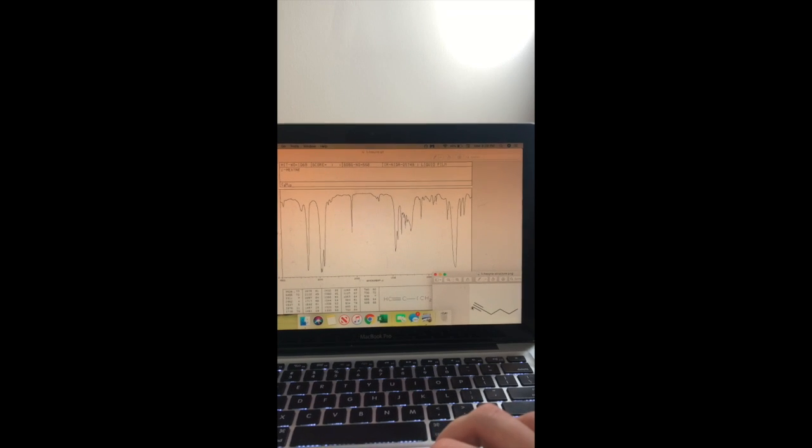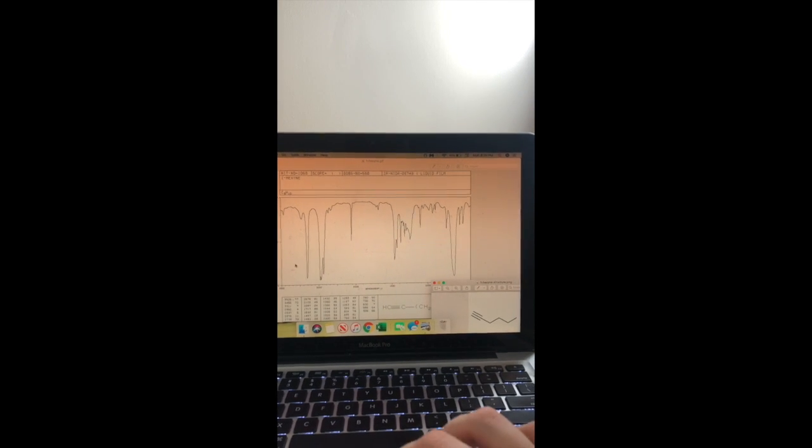Next we have 1-hexyne with two pi bonds between carbons 1 and 2. Because of the higher percent S character, alkynes, or triple bonds in general, require greater energy in order to cause a detectable vibrational stretch. Therefore, an sp hybridized carbon of an alkyne will appear on an IR spectrum at roughly 3300 wave number, which we see here. Like 1-hexene, the rest of the molecule is essentially the same as the straight chain alkane, with the same peaks appearing as mentioned earlier.